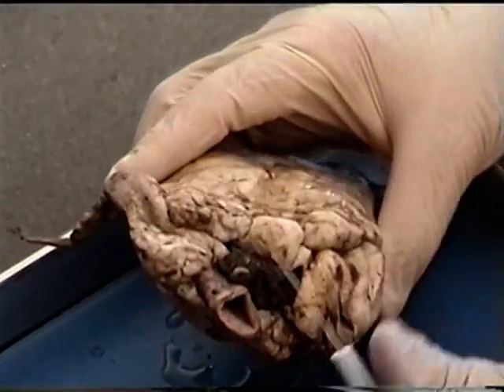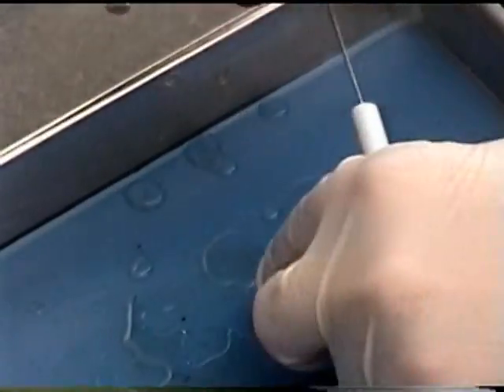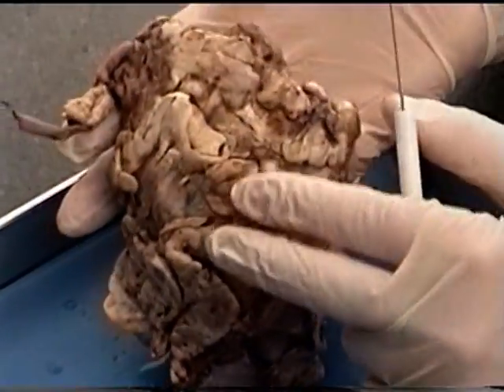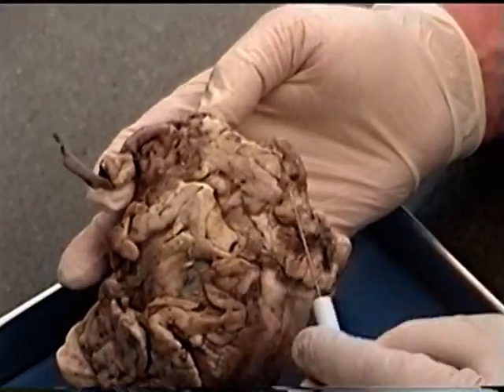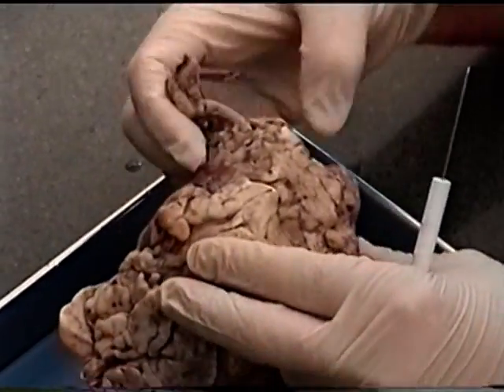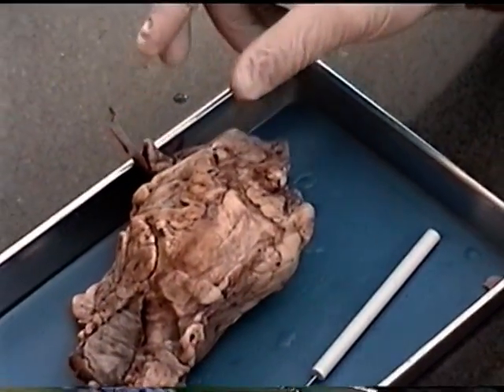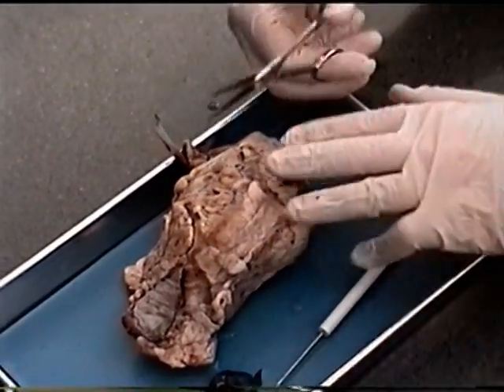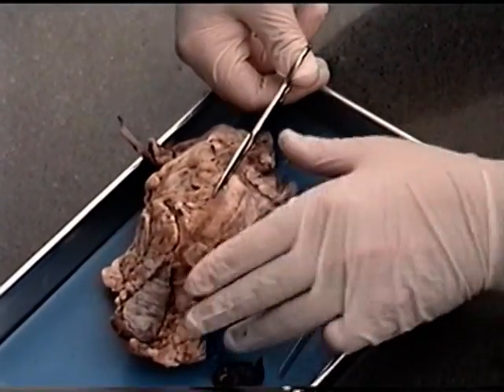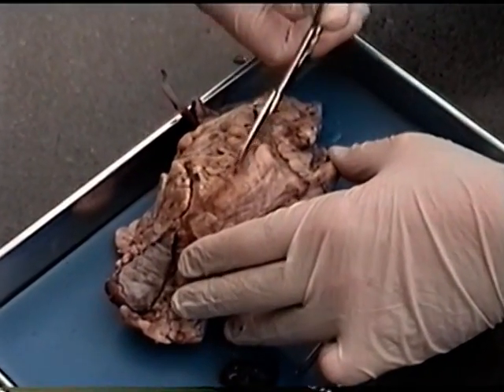Now when you look at the top of the heart, there's sometimes some tissue that can be found on that, although this is just coagulated blood. But occasionally we can find part of the thymus gland still attached to the heart up here. I don't see it on this particular heart. So we're going to take a pair of scissors and cut the pericardial sac. We're just going to cut downward through the pericardial sac here.